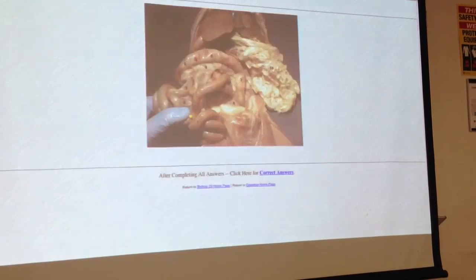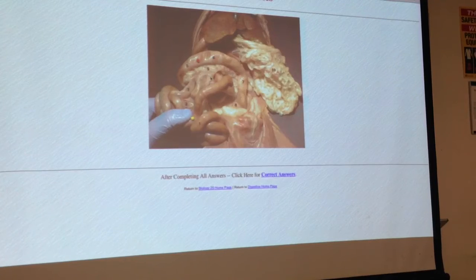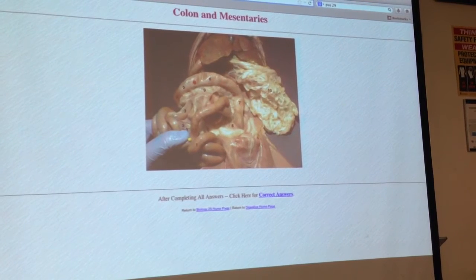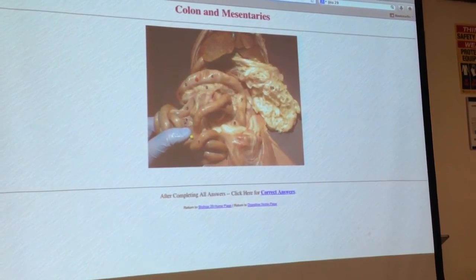And I think we actually, oh, this one's mesenteries, yeah. So here's a different view. We're going to hop to this one more in a second, but you can see that there's this net attached to it there, and actually here you can see where their finger is on the other side, and you can see it pretty clearly. So it's just the net that holds the intestine together.